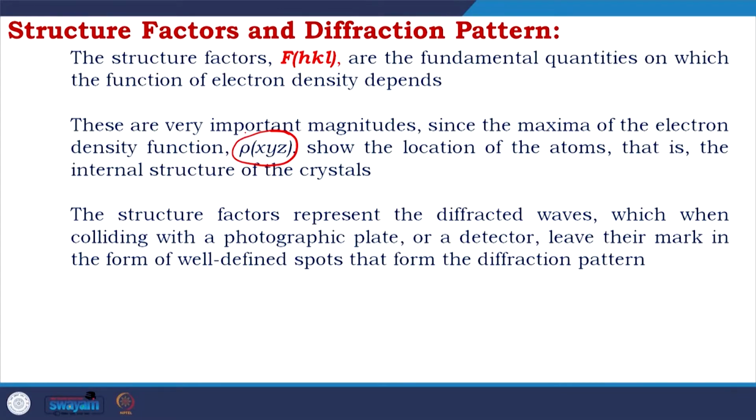The structure factors represent the diffracted waves which, when colliding with a photographic plate, which was usually used in old days, or a detector, which are now used, leave their mark in the form of well defined spots that form the diffraction pattern.